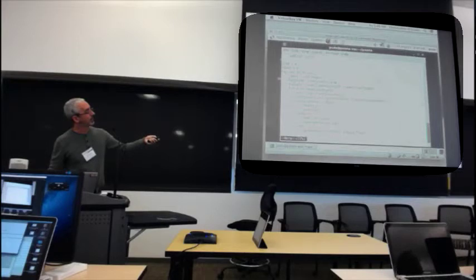So then you get those events for your particular rank, get the Princeton data, and then this is just a little bit of code to sum it up. So sum plus equals Princeton data. That's how you add two images together, and that's what you saw, the image accumulated. So we're almost done.